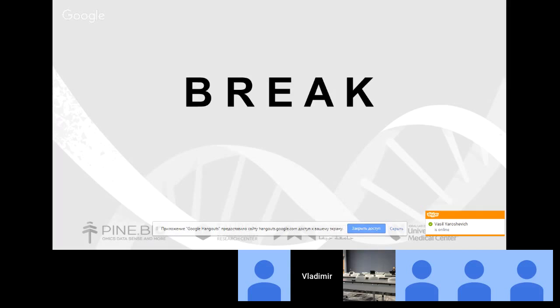After performing any kind of analysis aimed at identification of individual differentially expressed genes, DE-seq2 or edgeR or something different, there are multiple options for gene set enrichment analysis. DAVID is one of the options. Another option is, for example, GAGE. The number of tools is really huge, not only two. But DAVID analysis should be performed at their website, which is also very simple.